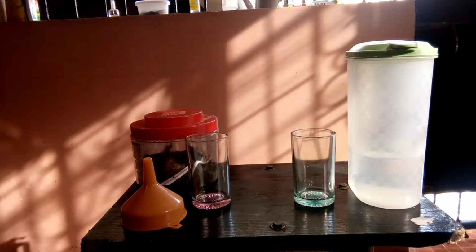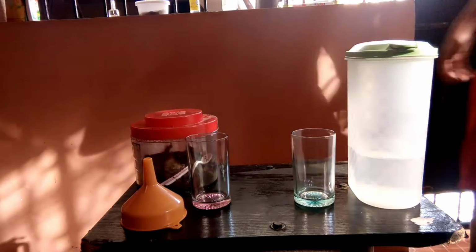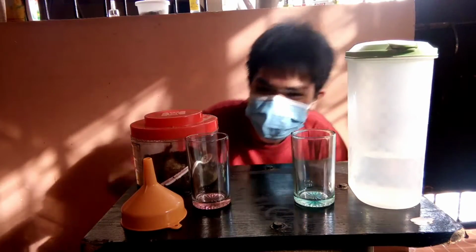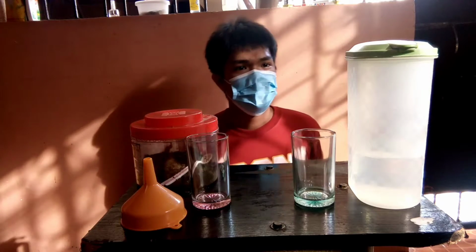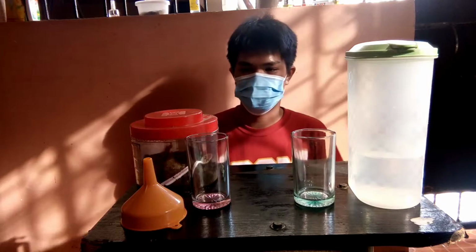Hello and welcome. We're going to separate the dirt and water mixture. So the first procedure we're going to do is to make the dirt and water mixture.